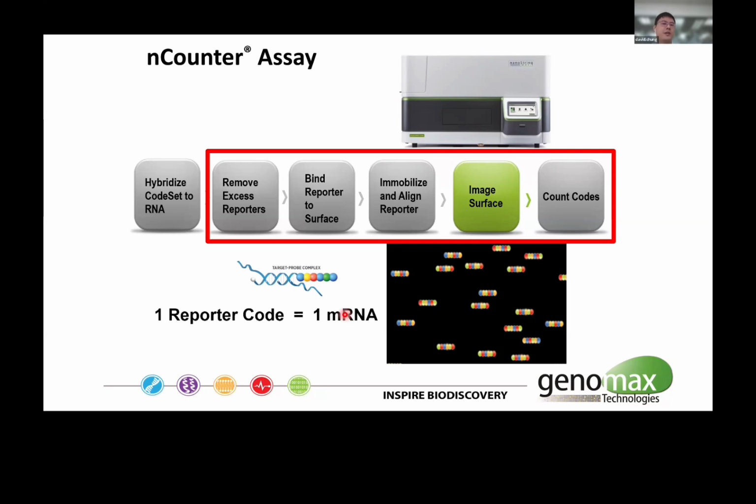So the fold change value, I would say, is probably more numerically accurate and more meaningful compared to using, let's say, qPCR, which is basically a difference in the CT value. The CT value is called when the signal has reached a certain threshold. So in a way, there is a bit of an approximation because of the quantification.